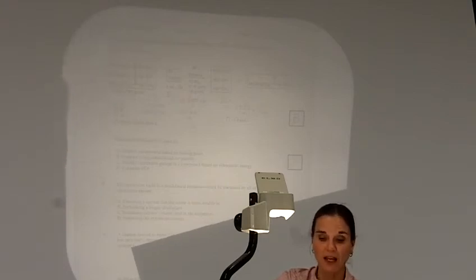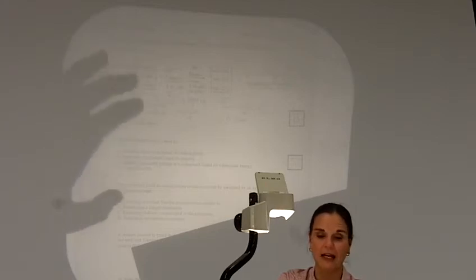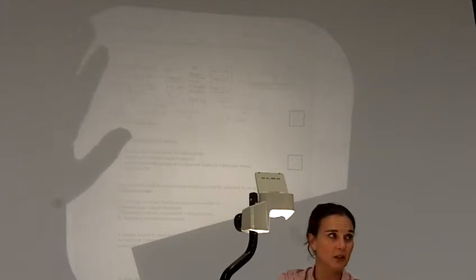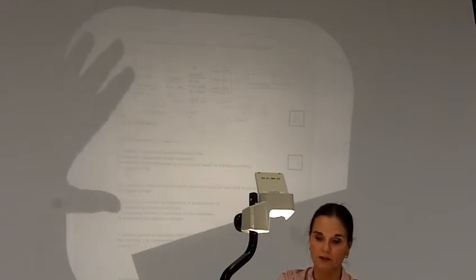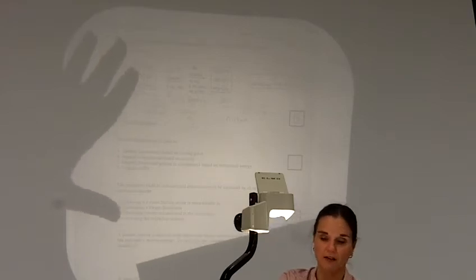All right, so back to number 8, choosing a solvent that the solute is more soluble in, that would be a good thing, right, for the extraction. So that's not an answer. Performing a longer distillation, would that help with your extraction? No. So the answer is B. Increasing solvent volume would help, and repeating the extraction process would help.